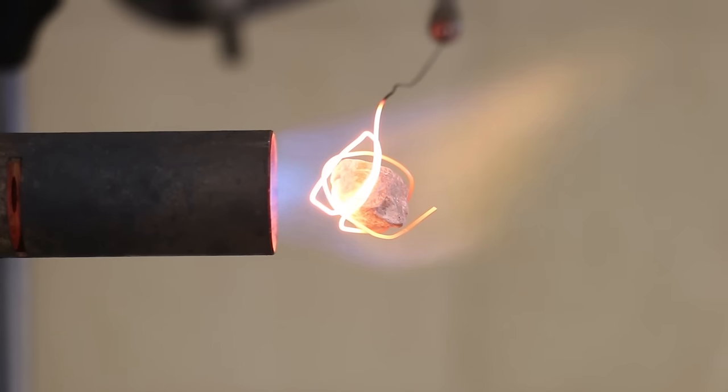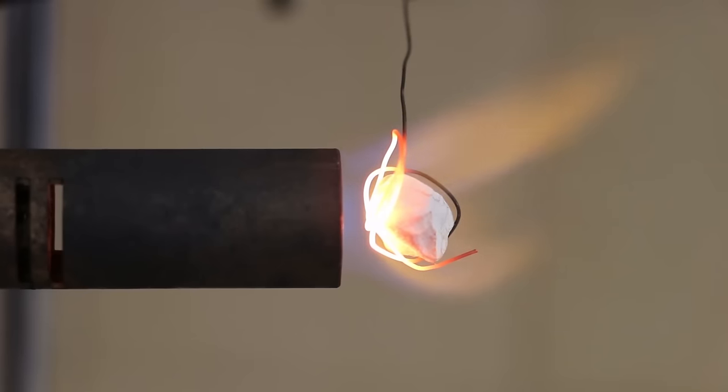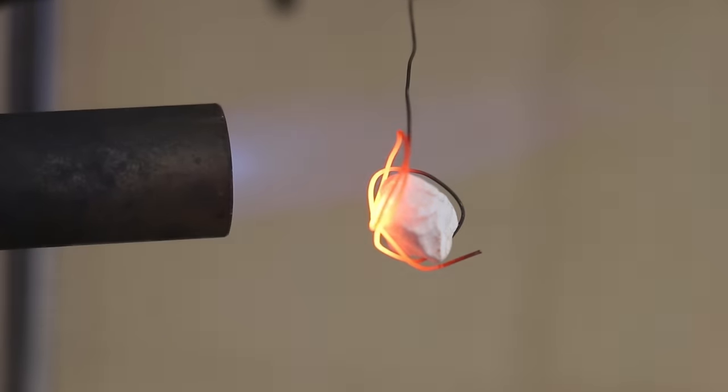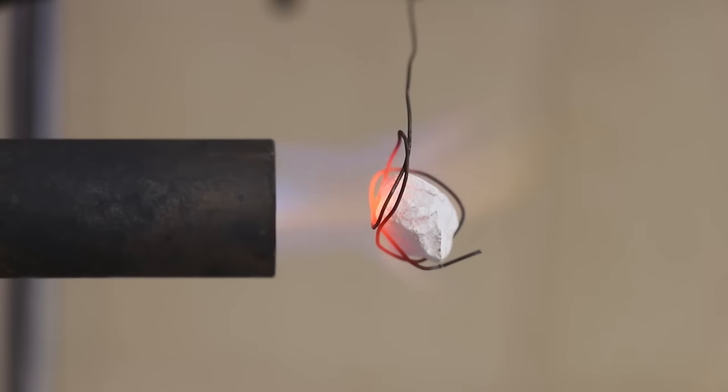As the limestone is heated, it starts to change colour, suggesting that some sort of chemical reaction is taking place. After heating this for a few minutes, we can start to see the whole piece of rock has changed colour and is starting to take on a whitish appearance.